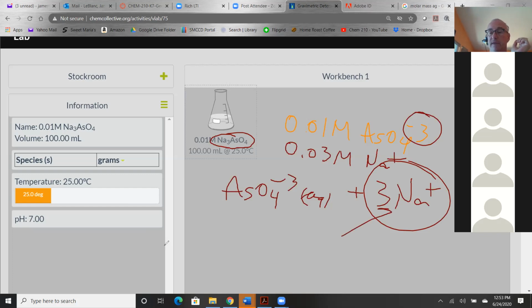Just a quick question. How do you use the material Na3AsO4 from the website? Like how you choose the volume, how you choose the solution? Oh, that's just the solution that's given. That's the concentration that's given. It's dilute, because we're going to be working with dilute solutions of arsenate. How can I get it on the website? Or is it automated, will it come? Do I need to click on any item? Oh, you don't know how to get it?